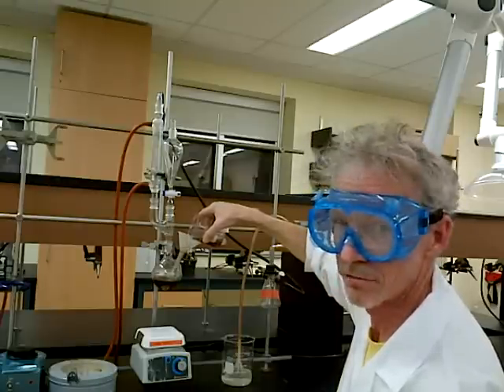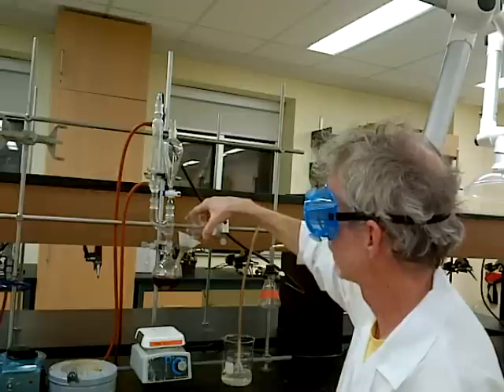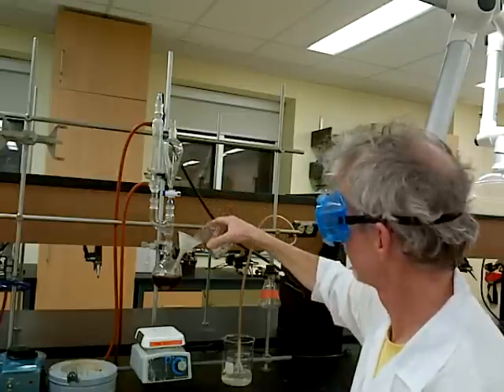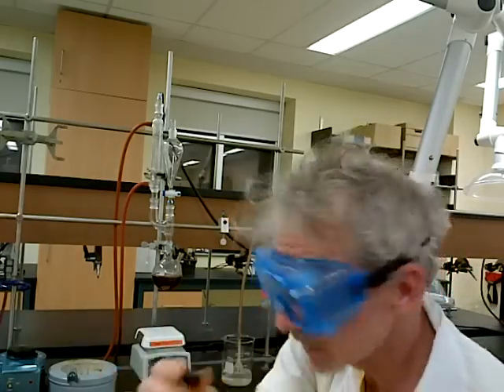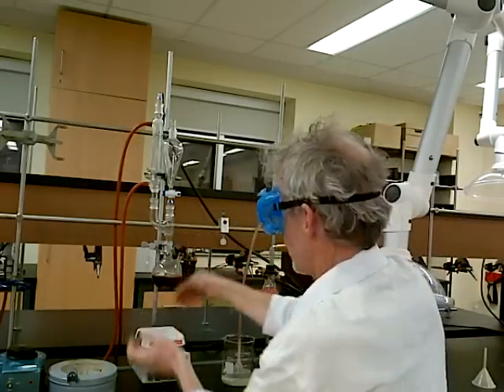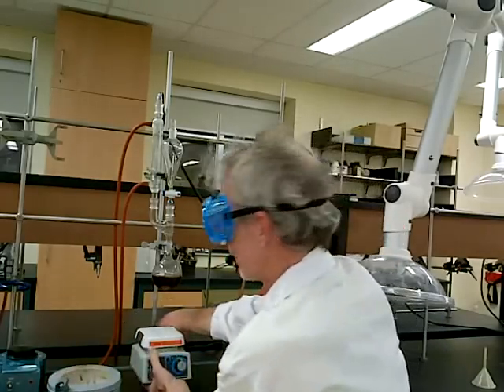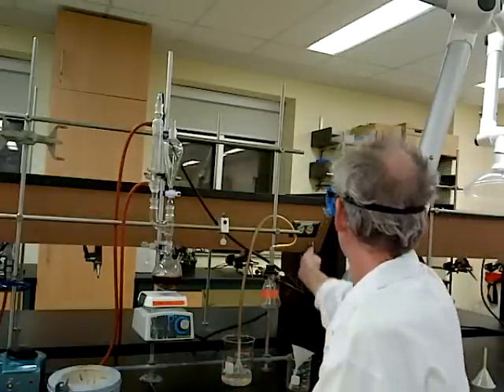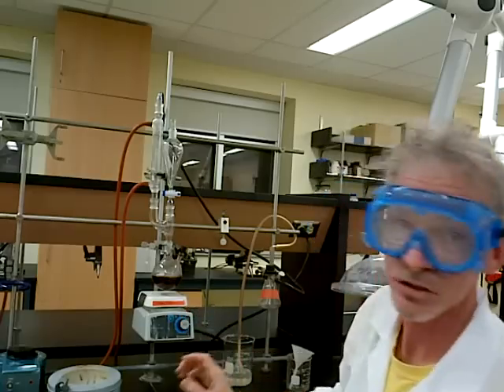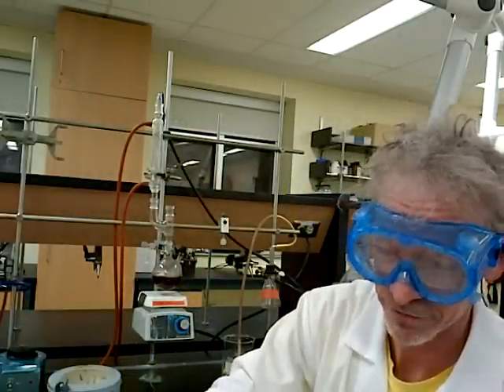The first part of our reaction does not require heating. We get this out of here and put the little stopper in. The distance is such that I can get the heating mantle in and out. We take our stir plate and bring it up. Plug it in and start stirring. Now, up there goes the sulfuric acid. You have to be really careful with sulfuric acid — that stuff will really burn you.